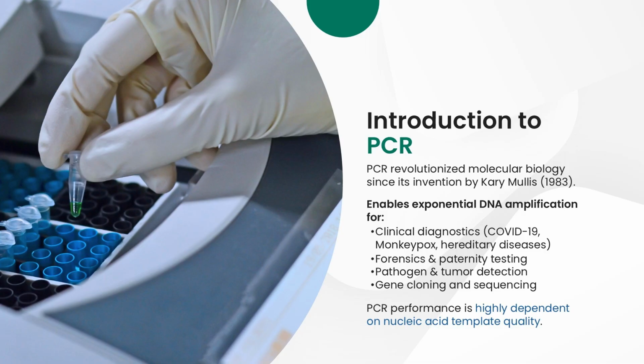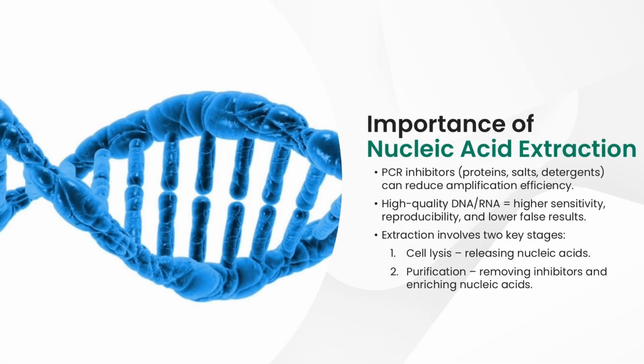However, what often determines the reliability of a PCR assay is not just the amplification step, but the quality of the DNA or RNA template that we start with. This leads us directly to the importance of nucleic acid extraction, the very first step in any PCR workflow. The analytical performance of PCR strongly depends on the integrity and purity of nucleic acids. If inhibitors such as proteins, salts, or detergents are present, amplification efficiency drops, sensitivity is reduced, and false results may occur. That's why extraction is critical.